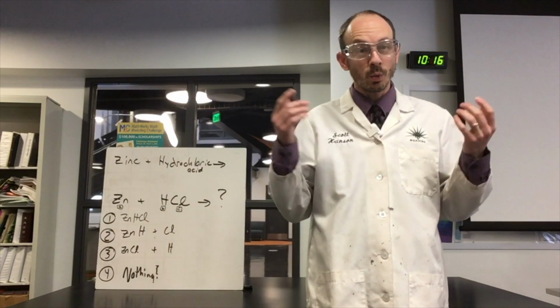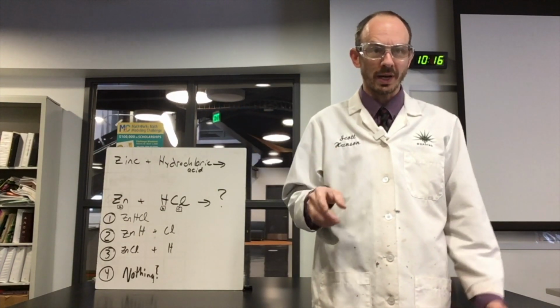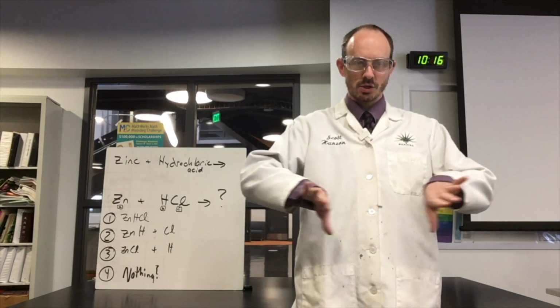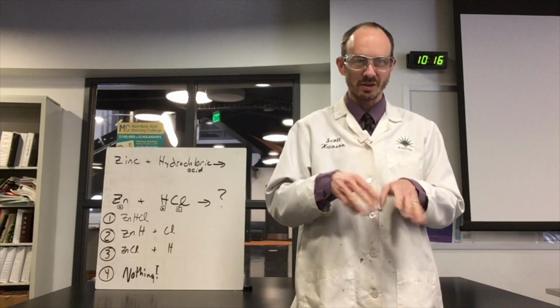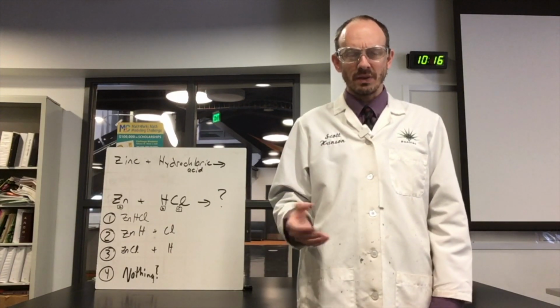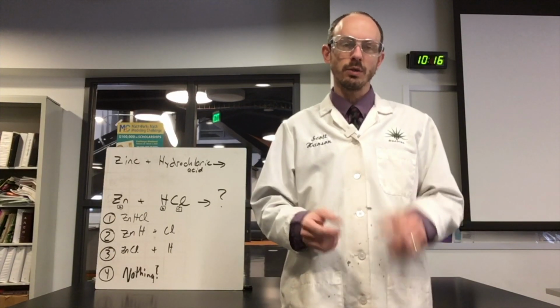All right, everyone, we have boiled away all the water. You saw that happen right before your eyes. At the very end, you saw me swirling it around because I was trying to make sure that we could boil away all that water, and the crystals, when they form, like to trap some of the water inside of them. So I was just trying to make sure that it spreads out to the side pretty evenly. We're trying to avoid this reddish color because that means it went just a little bit too far.